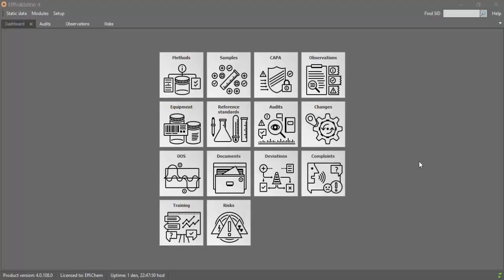If you're used to dealing with quality processes in your own facility, you're familiar with what these modules represent. If you don't deal with quality as a normal part of your work, but are intrigued, here's a quick explanation. Moving through the modules. CAPA, or corrective and preventive action, is some action which internally or externally the facility needs to take in order to prevent or correct a quality problem. CAPA comes from observations. Observations identify a problem or issue.